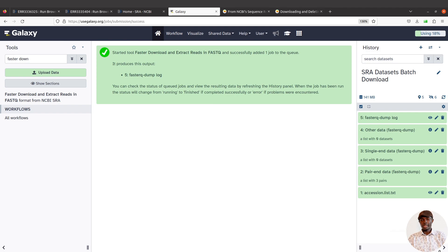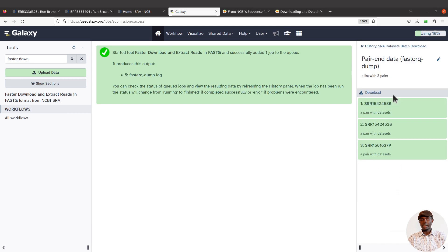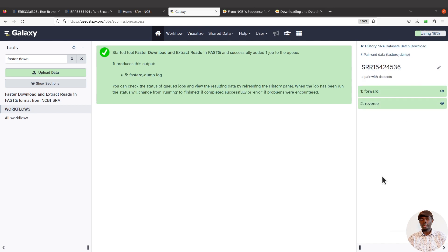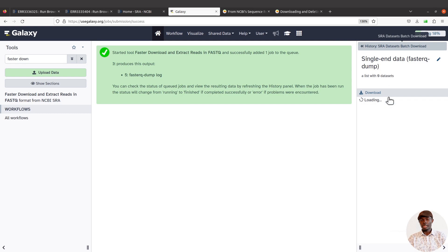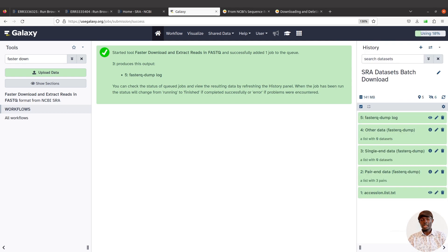The batch data has been imported. All three accession IDs we supplied were paired-end, so the paired-end dataset collection is populated — it says 'a list with three pairs'. Click it to find all three datasets; click on each to see the forward and reverse reads, which you can also download. The single-end dataset collection is empty because none of the accession IDs had single-end data.